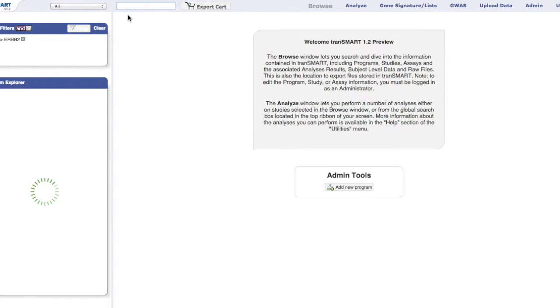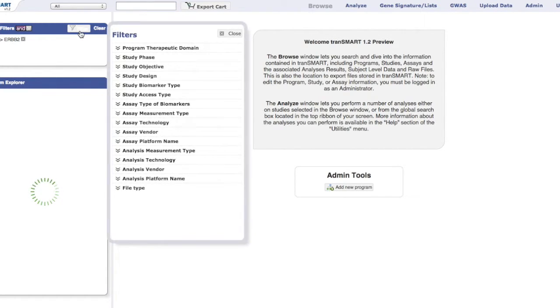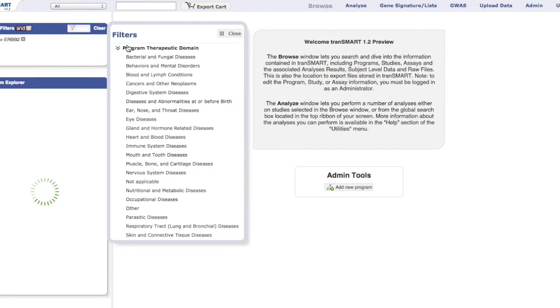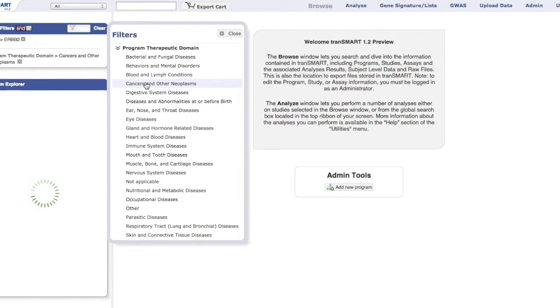Once the selection has been chosen, for example, the ERBB2 gene, it will appear on the active filters box. More filters can be added through this method, or by clicking on the filter button. For example, adding a specific program therapeutics domain.